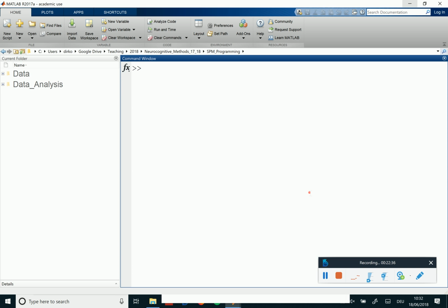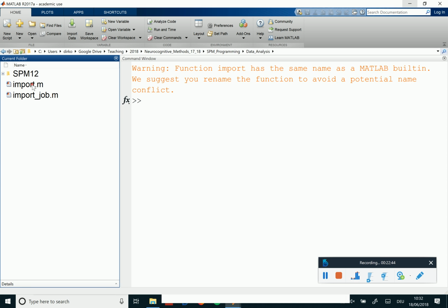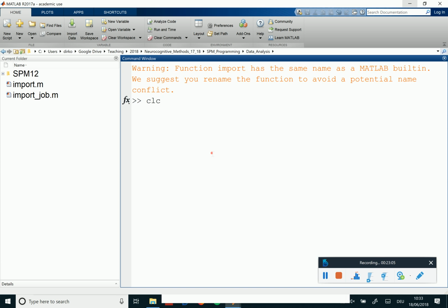We are master students in a good lab, which means that we write scripts and we take care of putting what we just did, this GUI thingy, into a script so that everything is nice and in order, and my obsessive compulsive disorder cravings are satisfied. This is what you get for these kinds of comments.